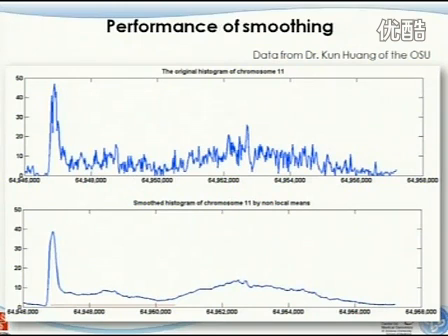So the sequencing is not deep enough, so for that region you get more reads versus not too many reads, and those are just a random sampling issue. If you sample deeply enough, you will probably get the noise smoothing out a little bit. It's also possible it's caused by a mappability issue or another type of chemical issue. For example, when you do sonication, where the breakdown happens, or especially when you use enzyme digestion, where those breakdowns could happen. So there's a lot of random effects happening, and that's why you see this type of signal.